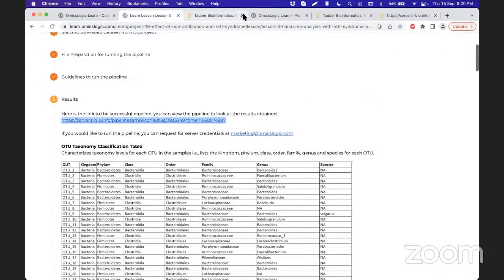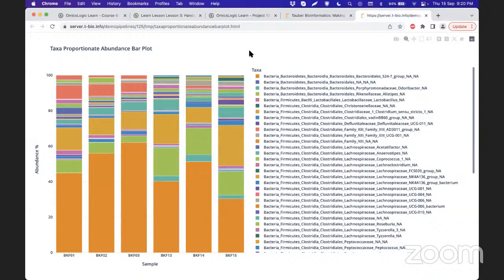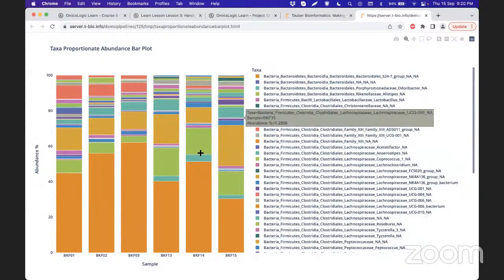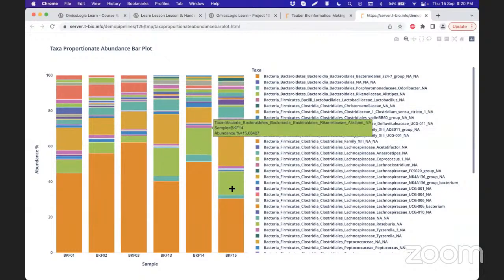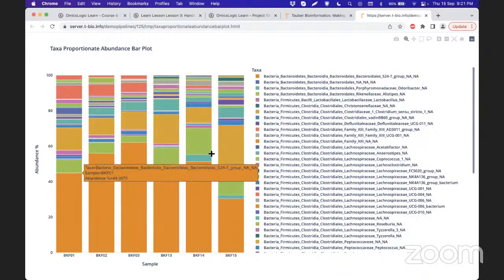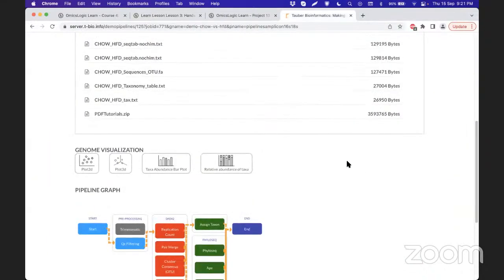Okay, we'll check that. So I wanted to show you that this proportional plot will help us clear some of the hypotheses that we generally develop once seeing the non-proportional or absolute abundance plot. Now, if we see the level of the bacterial identities in these three samples, they are absolutely identical because it is being scaled up or normalized across the different samples. That's what I wanted to show you. So this interactive visualization will help explore the abundance level of the microbial community from our sample.